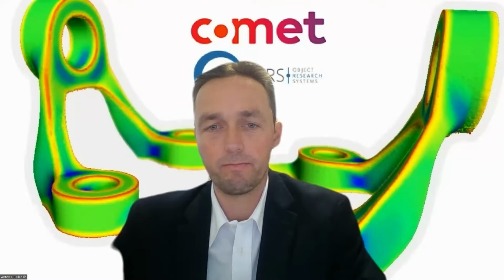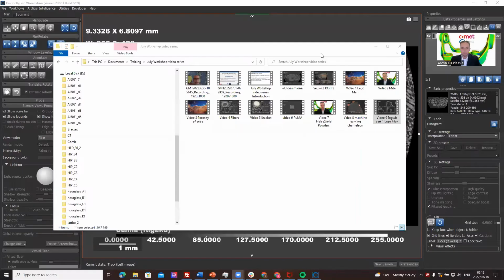Okay, back to Segmentation Wizard. This is the second Segmentation Wizard video. Let me start screen sharing.